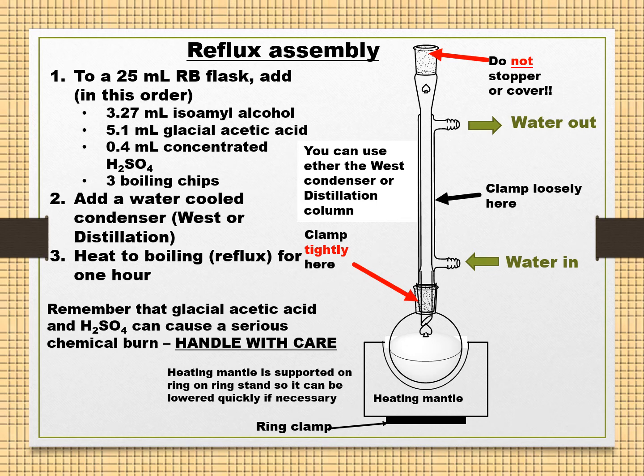Remember that we're using acetic acid, which is known to be very volatile and very irritant also, and we're also using sulfuric acid, one of the strongest acids, and you must handle any of these acids with great care.